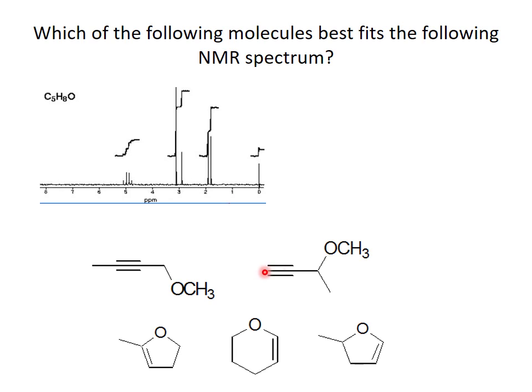Let's look at, well, we've got an acetylenic proton right there, and it would be a singlet because there's no hydrogens here. And where do they show up? Well, they show up in the range like 2.5 or so, maybe. Let's look up here. There's one at about 2.9. Well, that's a reasonable range for this proton.